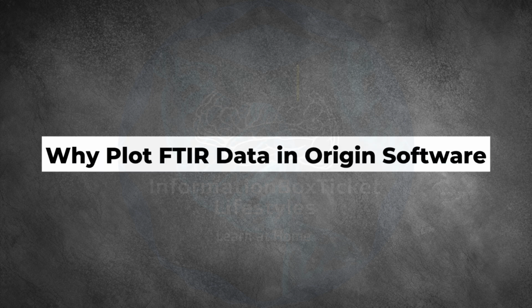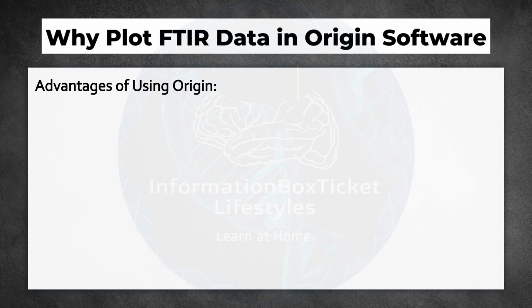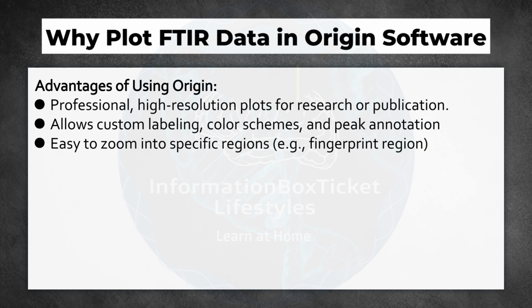Why plot FTIR data in Origin software? Advantages of using Origin. Professional high-resolution plots for research or publication. Allows custom labeling, color schemes, and peak annotation. Easy to zoom into specific regions, e.g., fingerprint region.